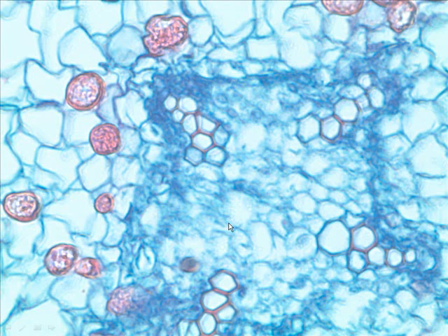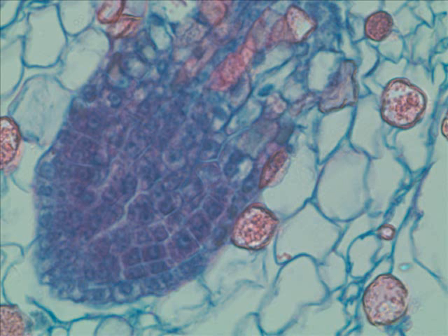Absolutely. And so here we are a little closer to the middle. You see those xylem ridges. For some reason, the xylem doesn't show up right here in the very middle. But here's our branch root. We could ask the same things about it.